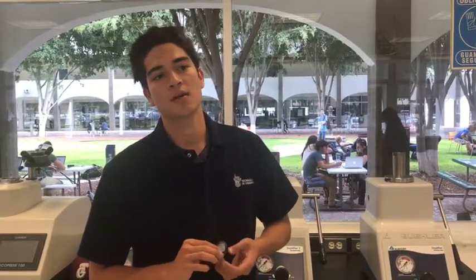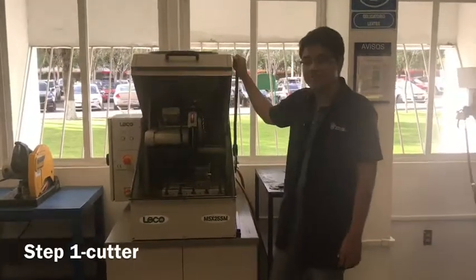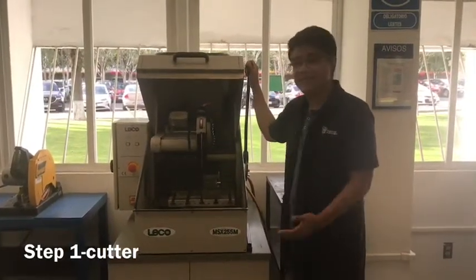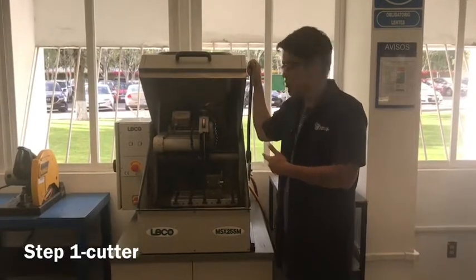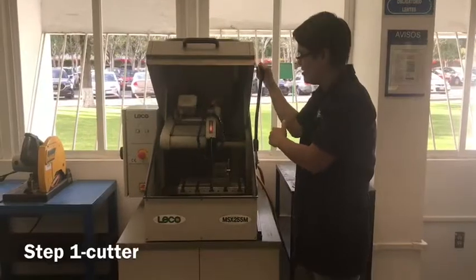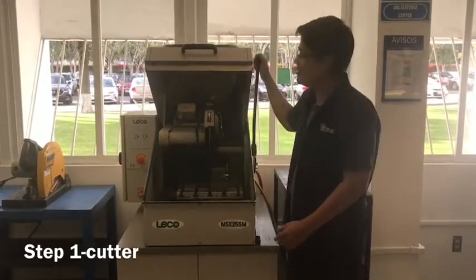To finish the process, we have to use a formula to get the exact number of grains with the help of the photo from the microscope. In this part we can see the cutter that is used to get the sample of the material that we are going to analyze. We can see that it is very easy to use. Just put your sample in here and pull this down to get the sample. Also, you have to use it with the right protection.